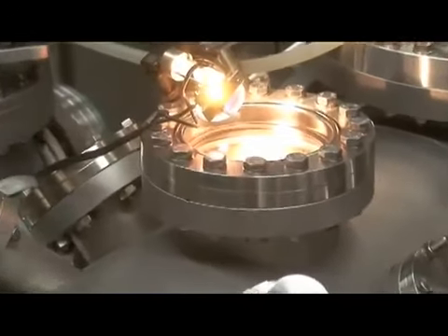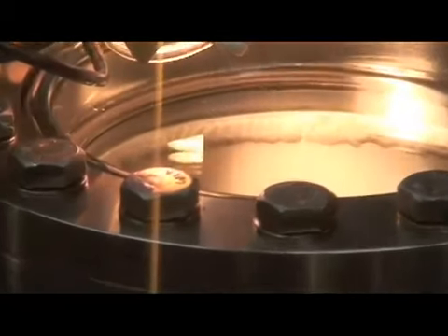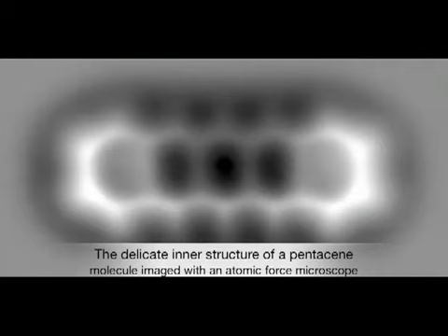individual pentacene molecules. IBM scientist Fabienne Mohn comments, "We are investigating single molecules, and probably everybody knows from the chemistry class in school that usually the chemists, they have these pictures, how they draw the molecules, these models, and with our work we were now able to really image these molecules like they appear in the chemistry textbooks."